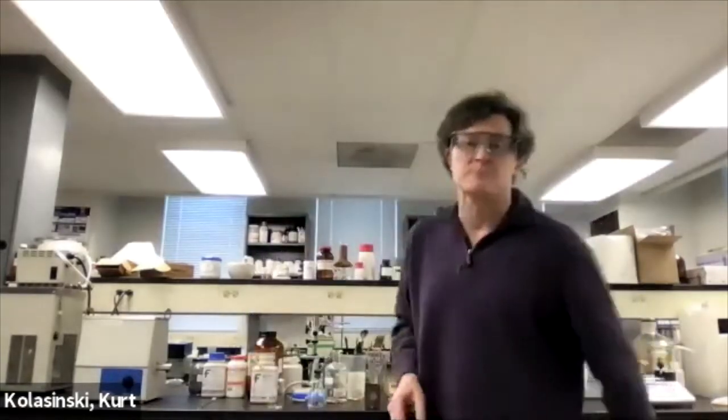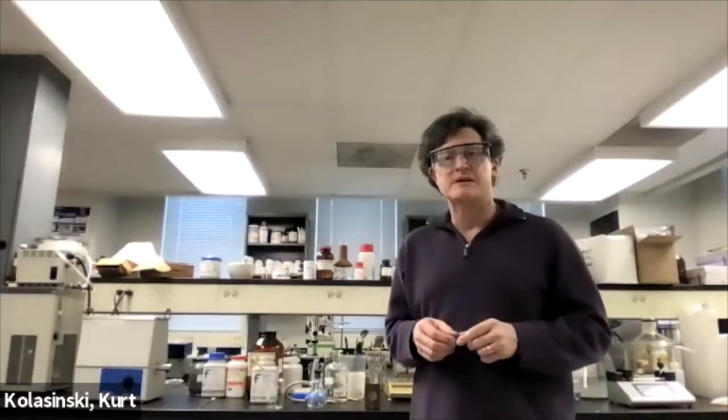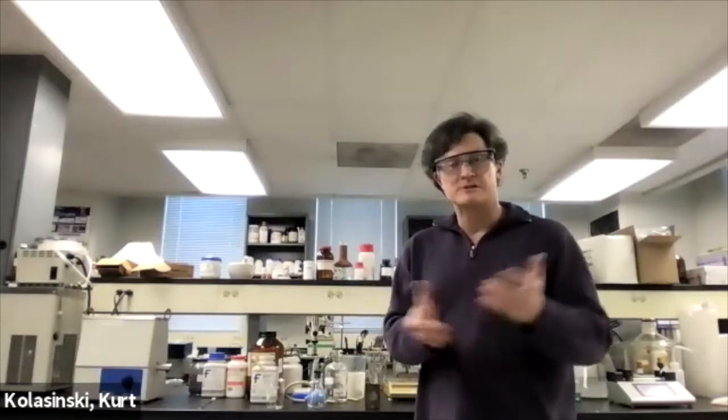Hello. Today we're going to do the infrared spectroscopy, the rovibrational spectrum of a diatomic molecule, and that diatomic molecule is going to be HCl. All right. We need to generate some HCl. We need to hold it in something, and we need to take its spectroscopy. So how are we going to do that?